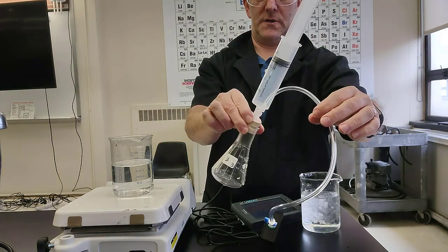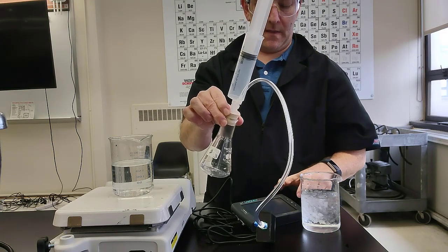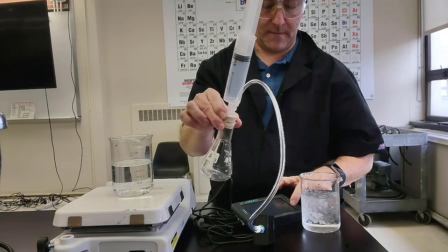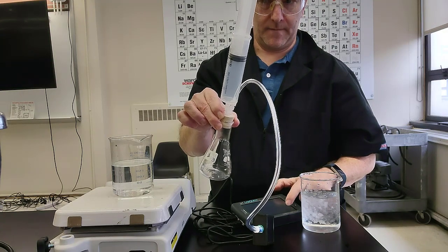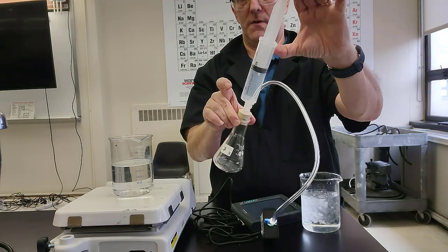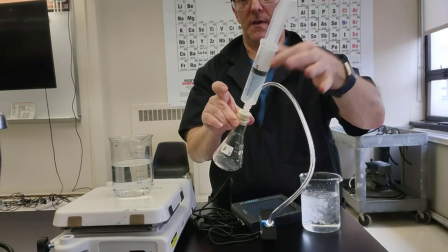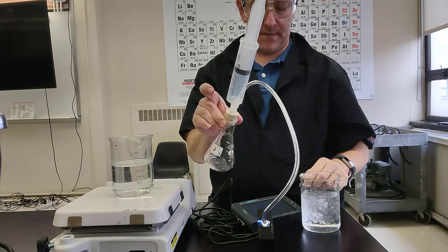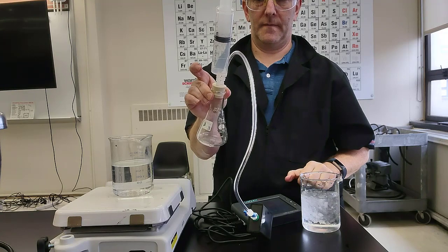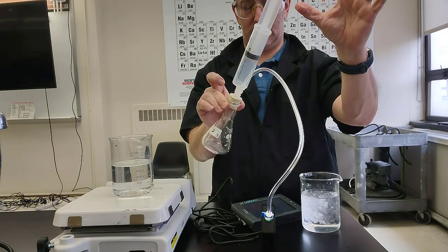Let it cool to room temperature and see what happens. The pressure inside the syringe was at 1 atmosphere. I don't think our syringe is moving well enough. Oh, yeah, there you go. You can see if I try and force it down, it goes back up. The air in here is at an elevated temperature still. As it cools to room temperature, let's see what happens.